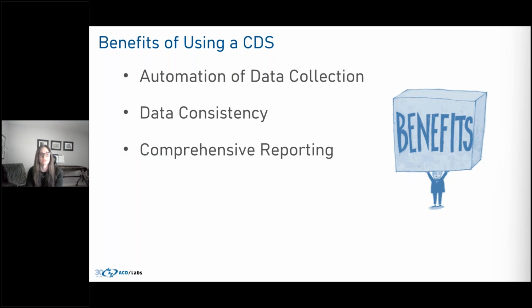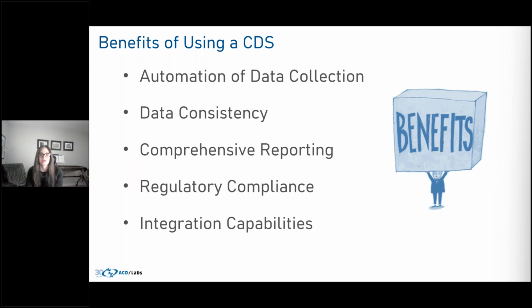There's also the regulatory compliance side of things. These systems have detailed records and audit trails that help ensure compliance with industry regulations. And finally, integration capabilities. The CDSs can connect with various instruments and other systems like LIMS for centralized data management.